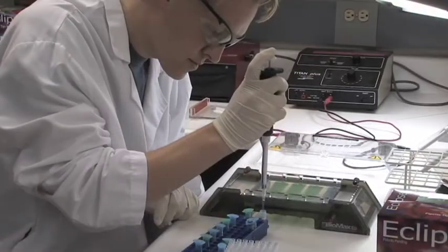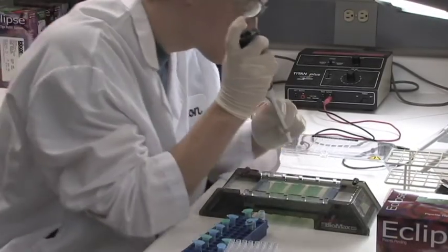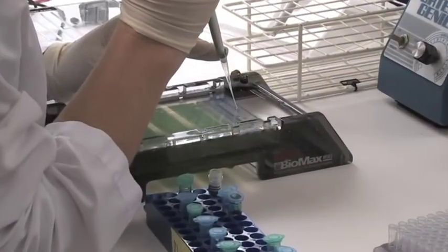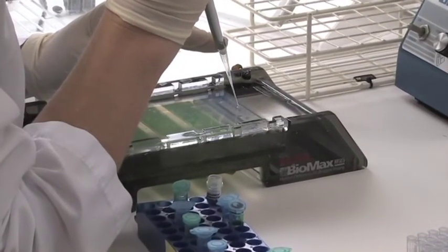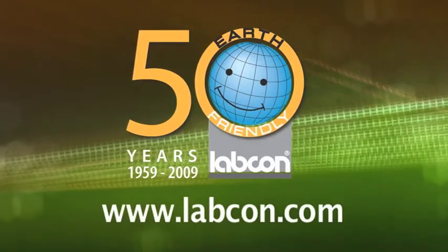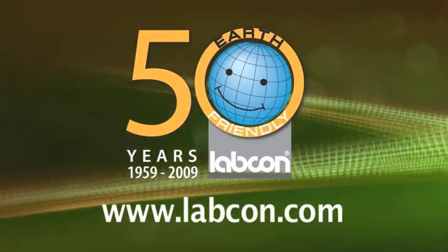To be sure you can use SuperSlick tips with confidence, we test every lot for protease, nuclease, endotoxin and DNA contaminants. For more information, please call or visit us online.